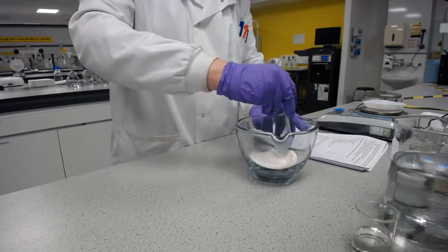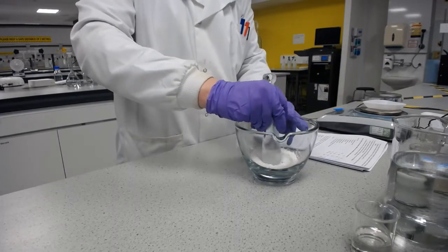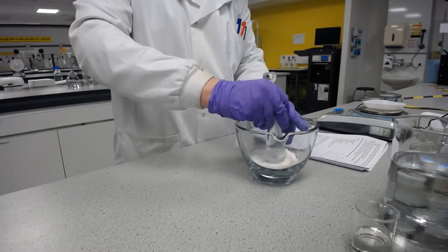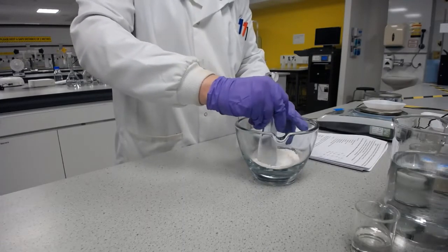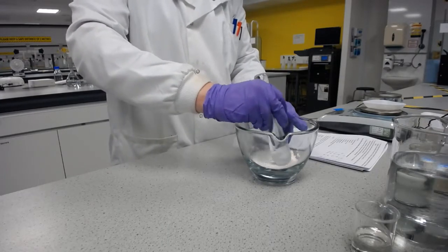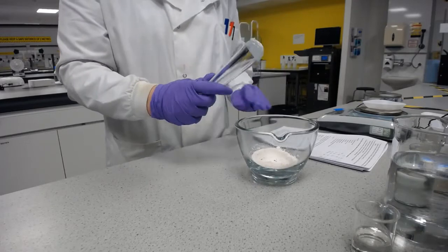I'm not trying to crush it like you may in some other labs, or if you're trying to make an emulsion. We're just mixing. If I put too much shear force on here, we'll start to compact the powder together, which may make it hard to work with later, and we'll also reduce the powder size such that we may get more caking. So we've already got the powder size we want, and we don't want to reduce it anymore at this stage with the dry powder. Okay, so that's all mixed.